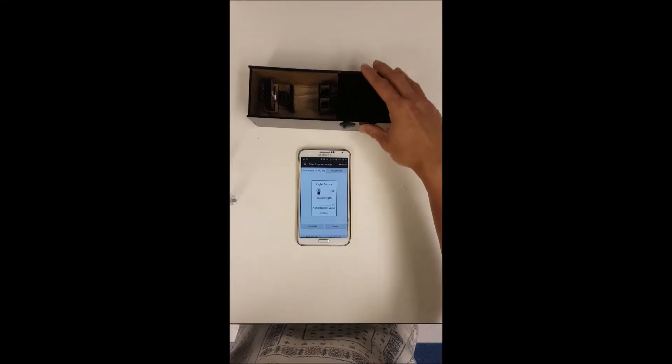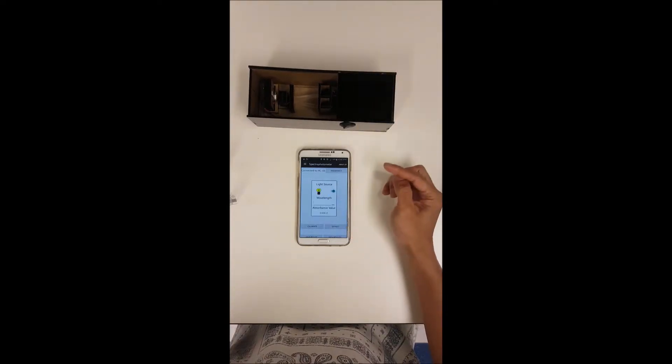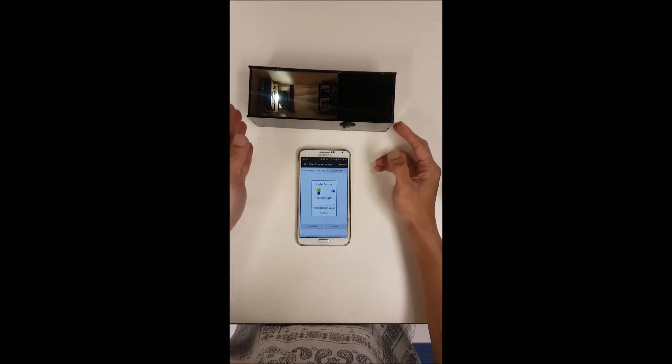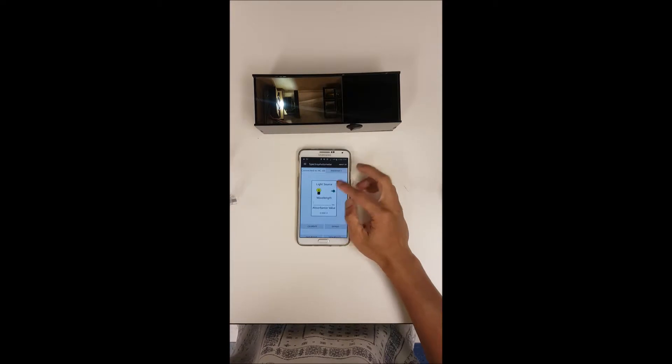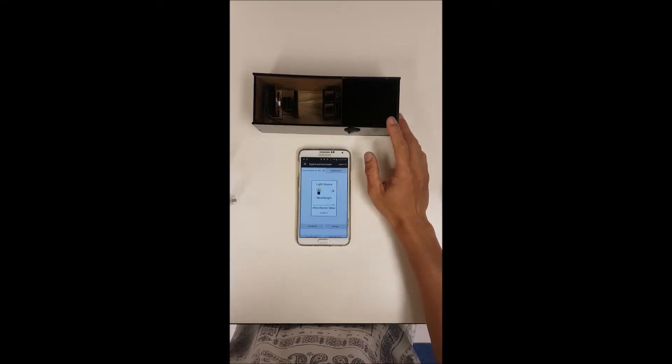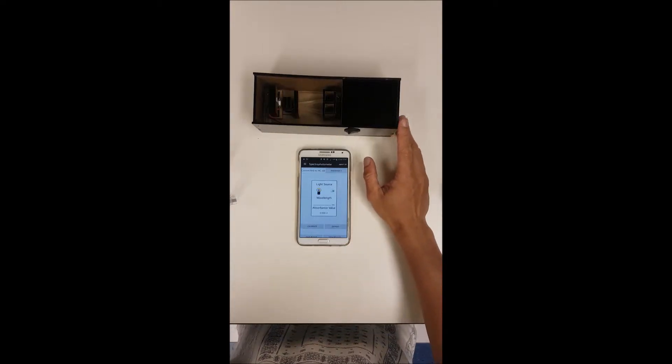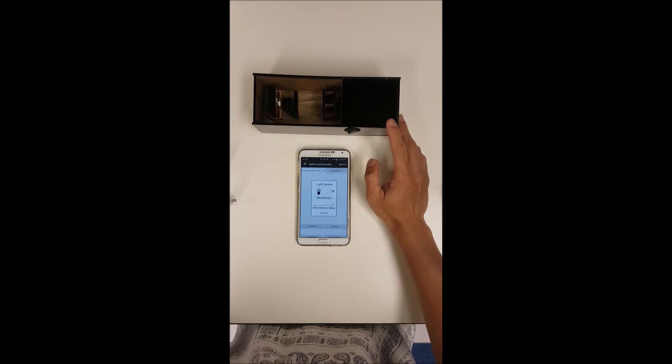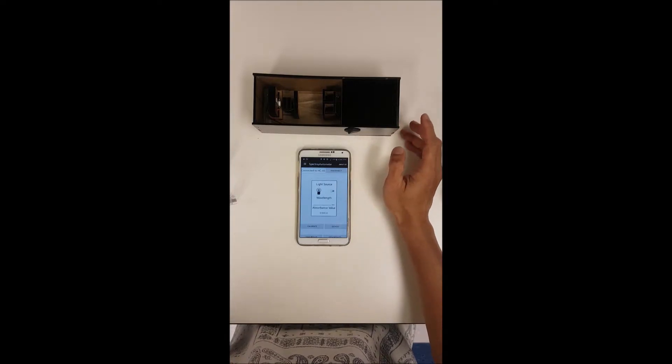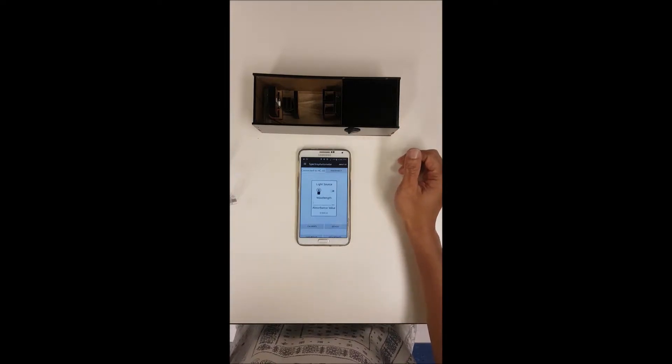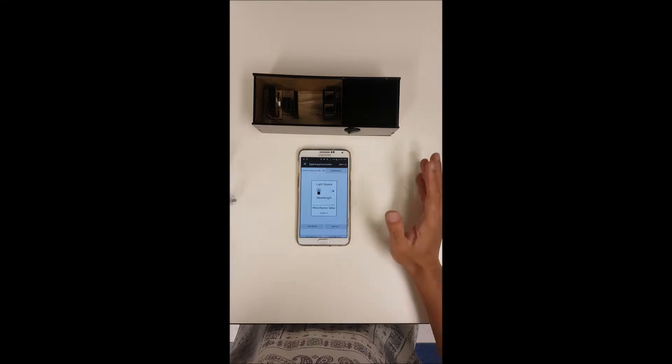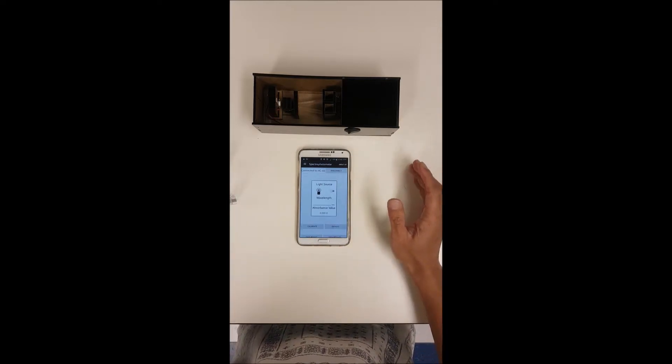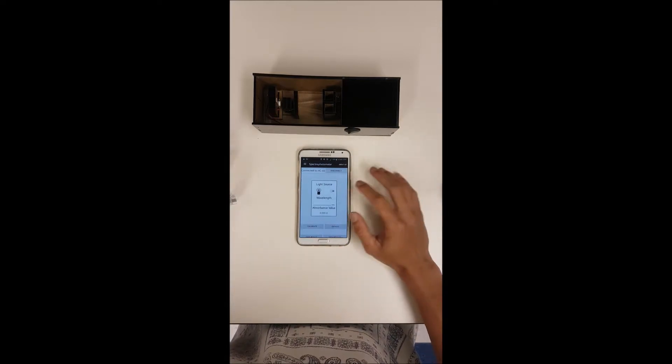You will be able to see there's a light toggle switch here where you can turn on and off the light source which is the LED. In this prototype we only have the visible light and so we are going to use a Bradford assay to determine protein quantification here.